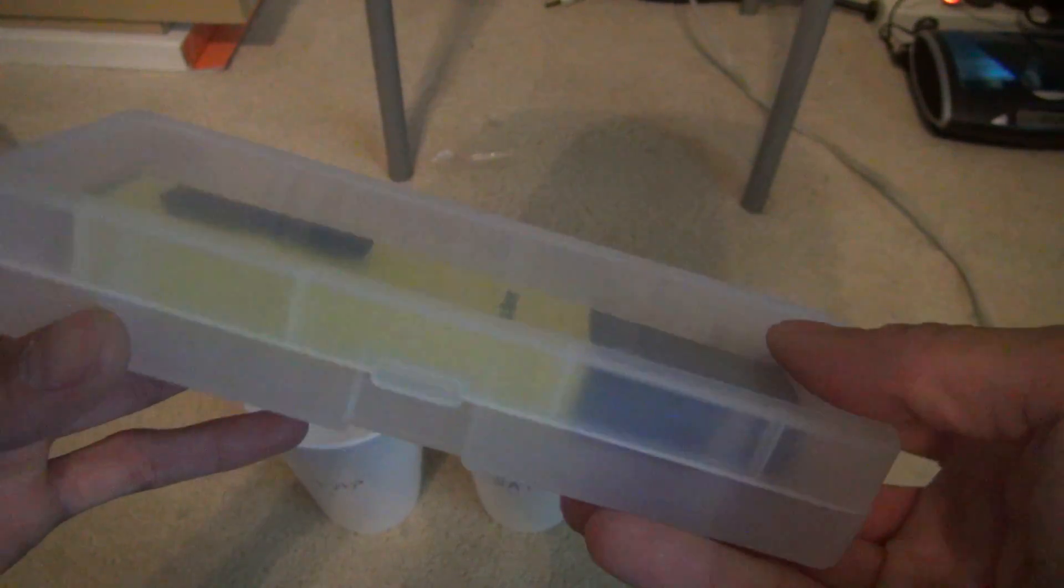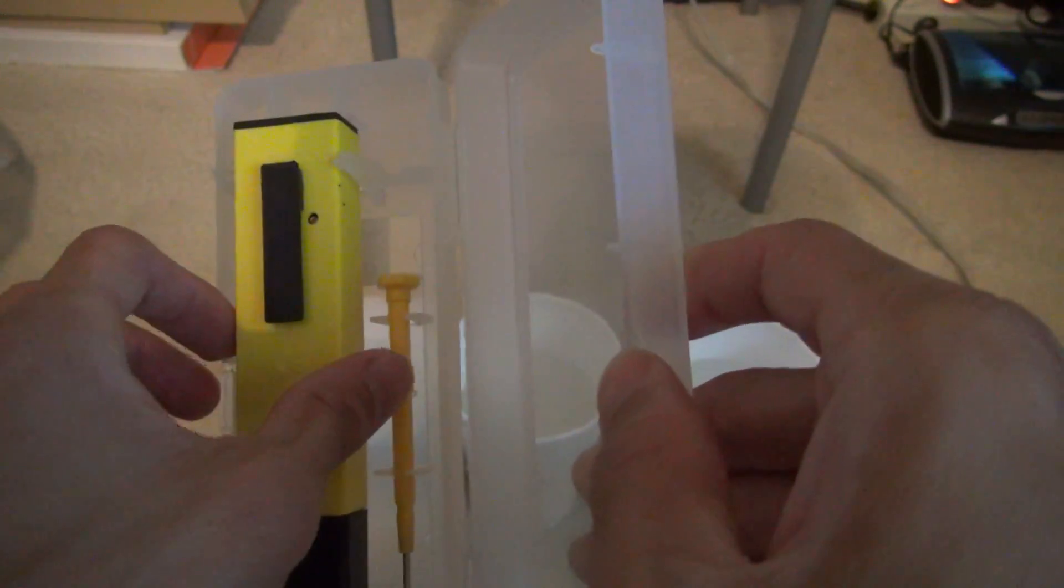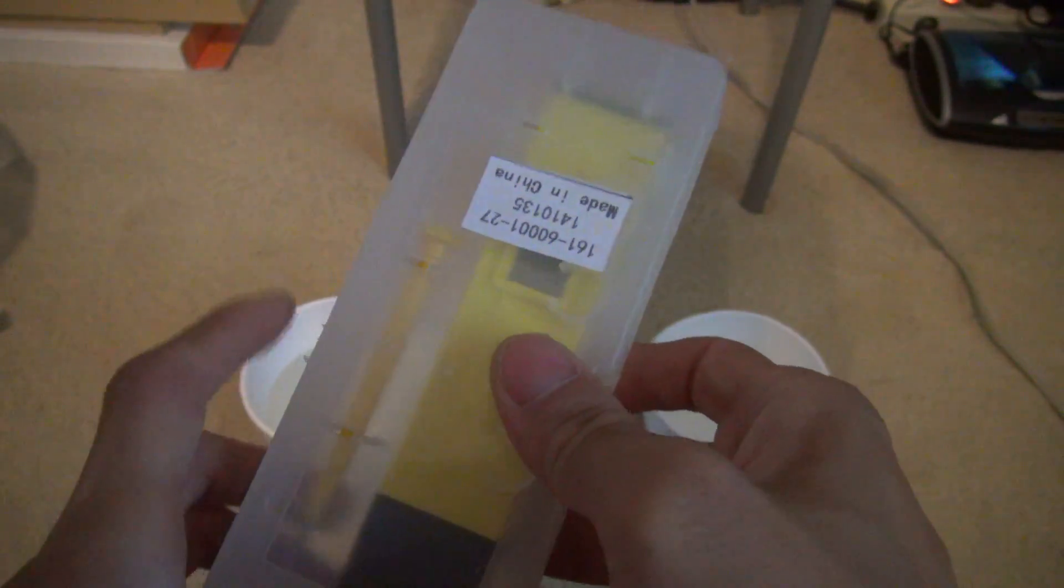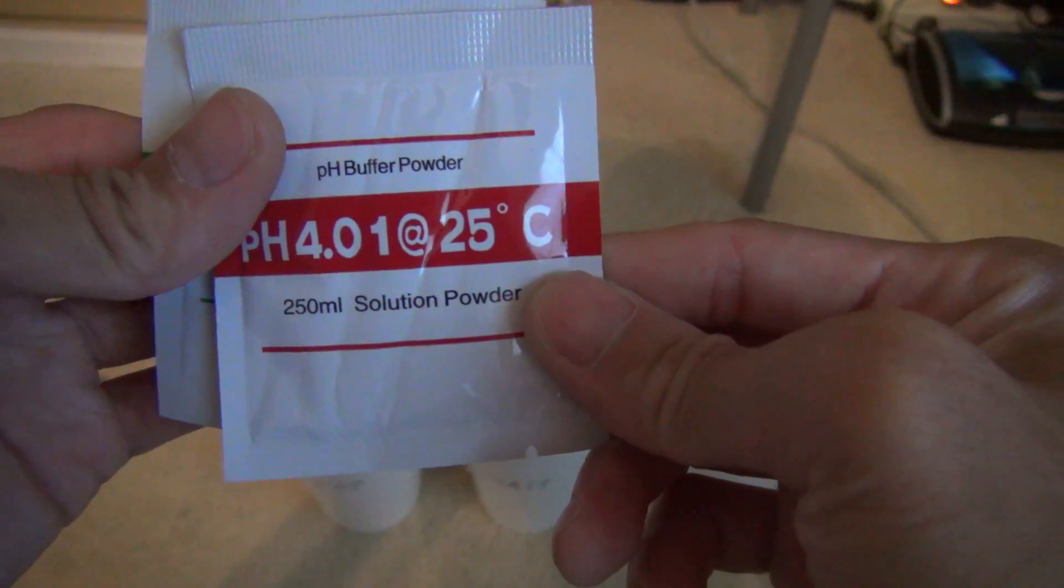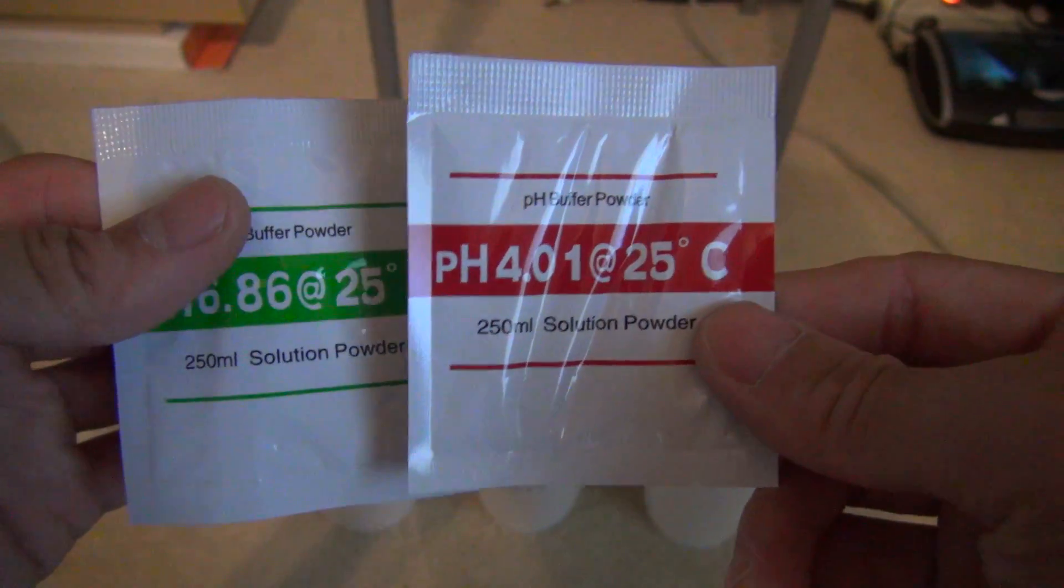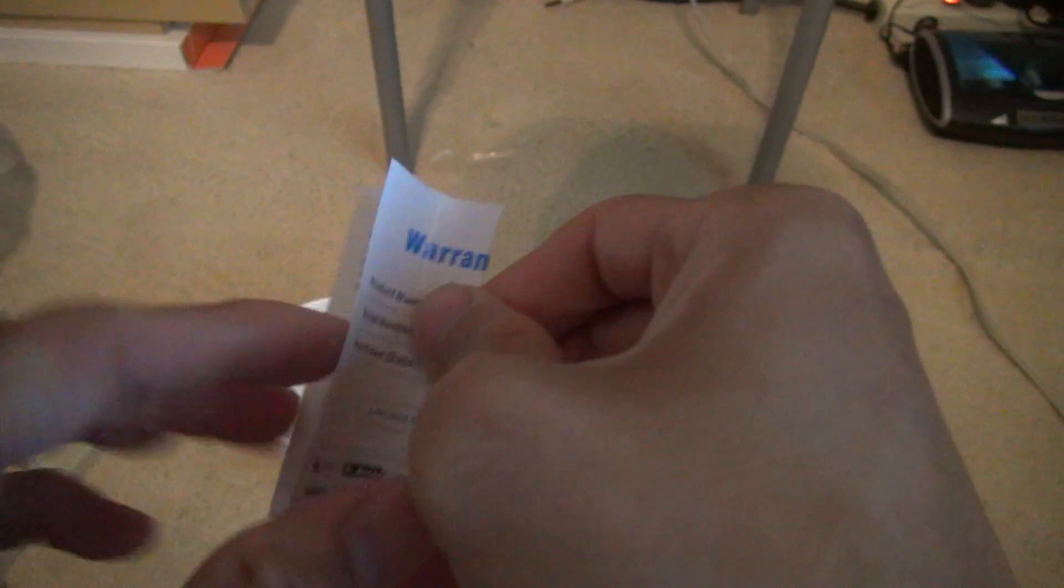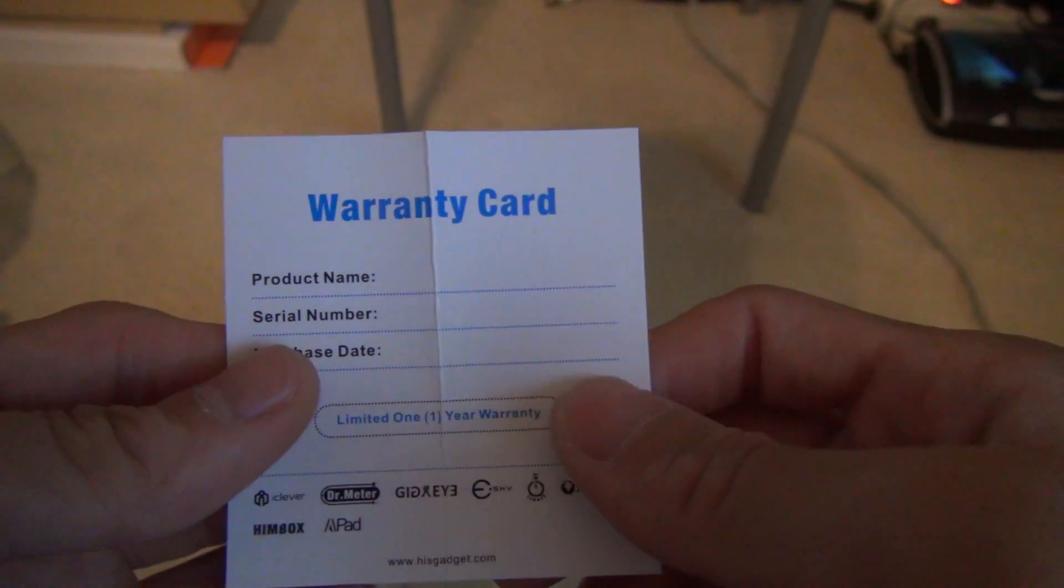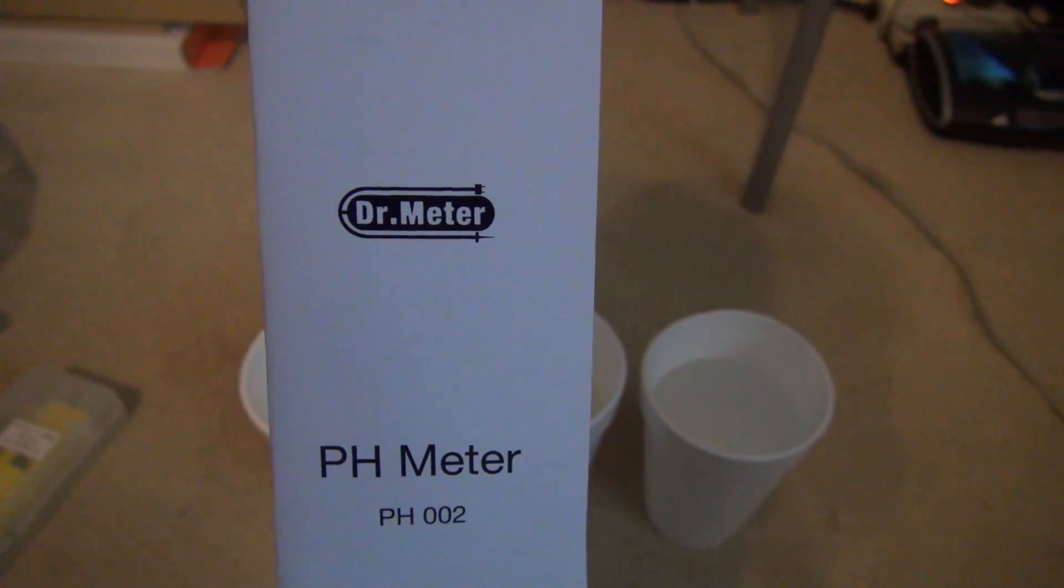In your package content you will get the Dr. Meter with a calibration tool, a carrying case, two solution powders, your warranty card and a user manual.